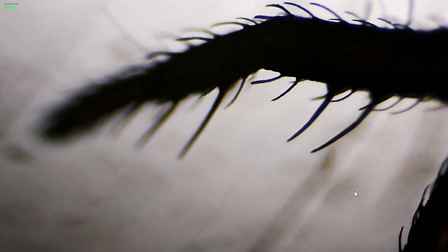We are now under the microscope, and I have to say this guy, for a crab spider, he's quite small. Normally they're going to be much bigger, but it's good for us because we get to have a good look at this guy.